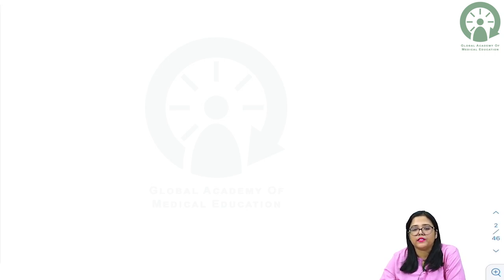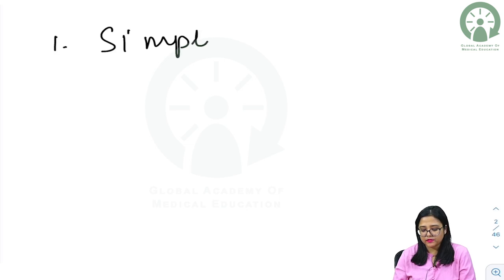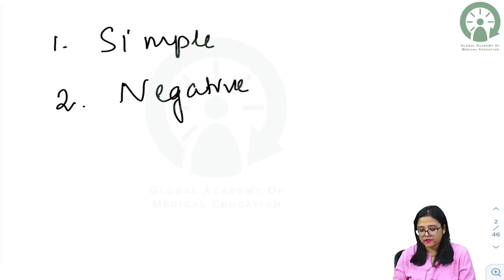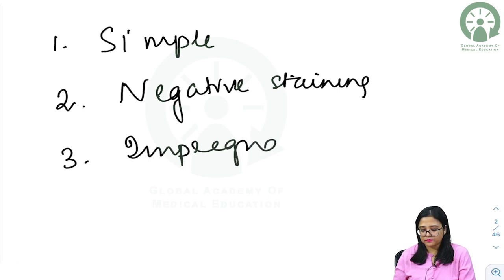Let us begin by discussing staining methods in microbiology. So what are the different staining methods? We have number 1, simple staining method. Number 2, we have negative staining. Third we have is impregnation method. Fourth we have is differential staining.